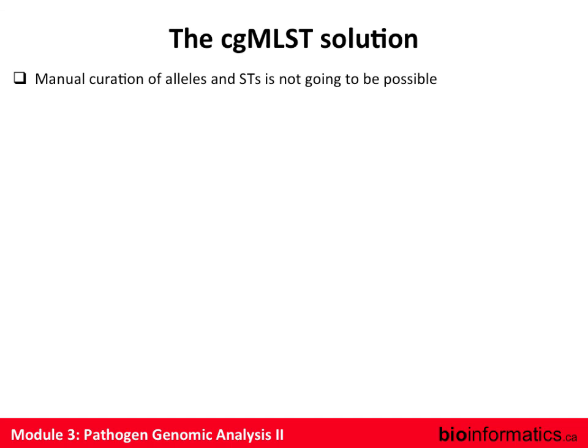So this brought the concept of cgMLST. cgMLST is just MLST, but using core genes. Only core genes. We get rid of everything else.